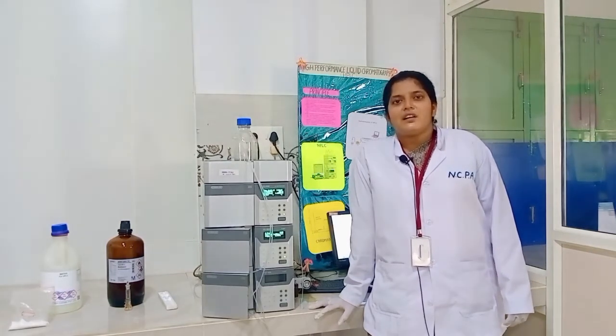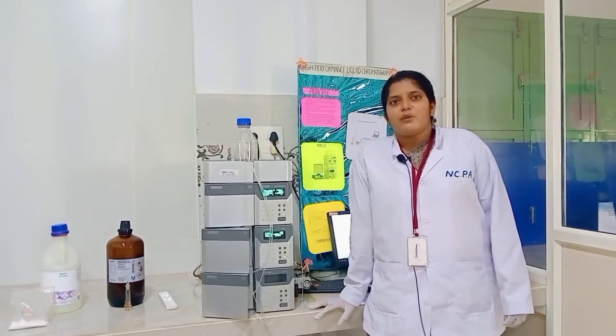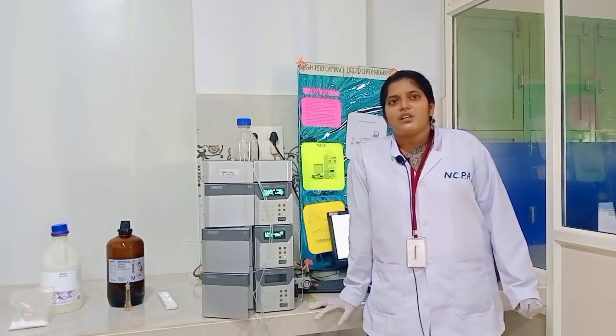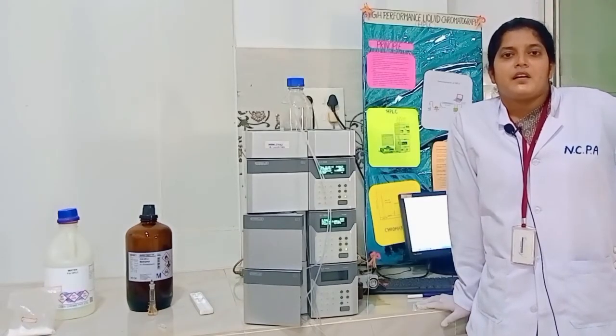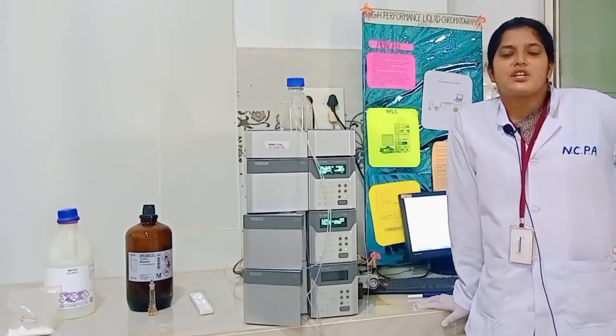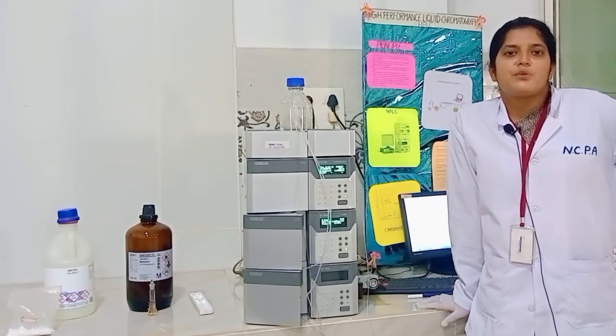In qualitative analysis, by comparing the retention times of the sample with the standard, we can identify the compound. Quantitative analysis of the compound is done by the direct comparison method, the calibration curve method, and the internal standard method. It is also used in multi-component analysis. It is used for the detection of impurities in the sample, and also for the determination of the purity of compounds.